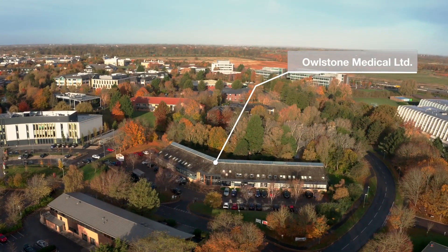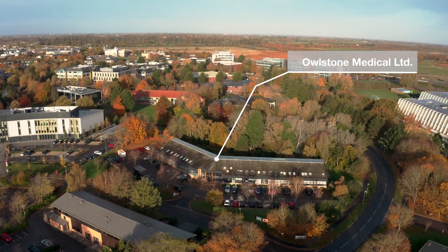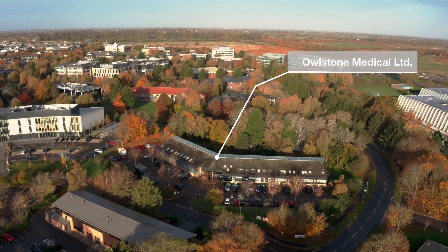Here at Owlstone in Cambridge, UK, we specialize in breath biopsy, measuring the chemical makeup of volatile organic compounds in breath to provide non-invasive pain-free detection of diseases at the earliest possible stage.